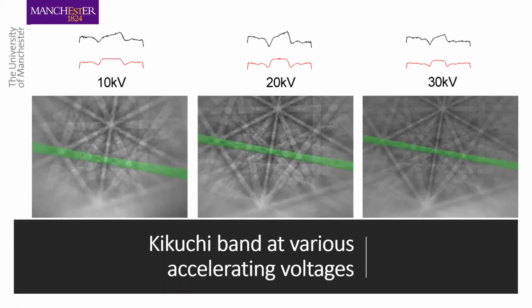That's one thing that one can change, the tilt angle, and you have an option to do that. But also the voltage. So the higher the voltage, the narrower the bands. You can see the same patterns here of, sorry, this is of iron, I think, where you can see the bands are narrower. The same band at 10 kV is wider.